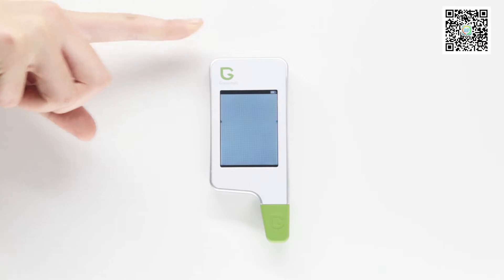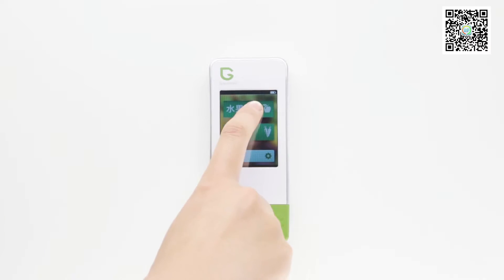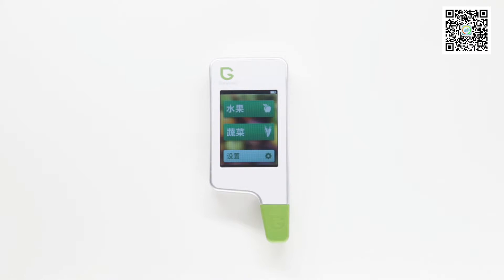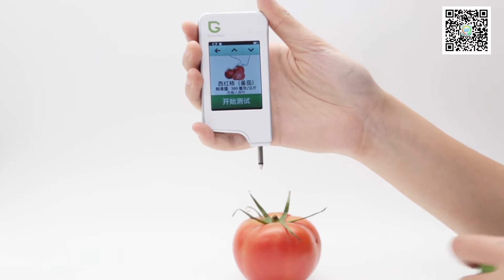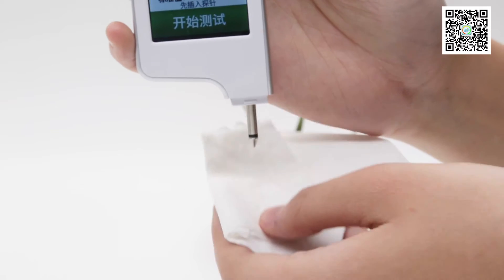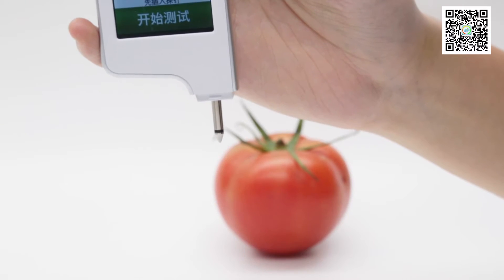Power on the Green Test. Select the fruits or vegetables you need from the screen menu and bring the selected fruits or vegetables. Pull off the lid at the bottom of it and clean it with a dry cloth or tissue. In this way you can get the most accurate result.